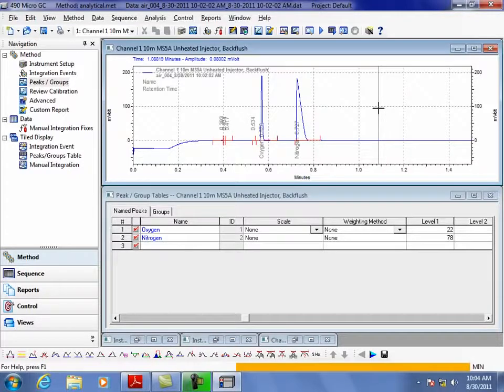It'd be better if I had a 5%, and that's because what you're looking at is 5.000. Okay, well, my reproducibility is somewhere around here. That's 1,000. That's 100. So 10 ppm is my limit by doing external standard of what I could expect the analyzer to reproduce. So I don't want to get any better than this.